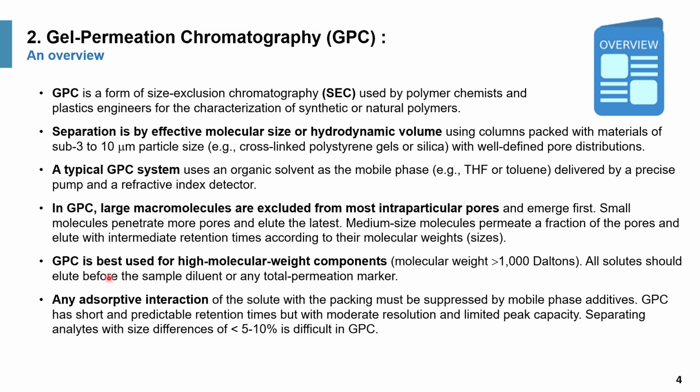Some overview and terminology. GPC, the terminology, is synonymous with size exclusion chromatography. GPC specifically, when it's used for polymer chemists and plastic engineers, we call them GPC.